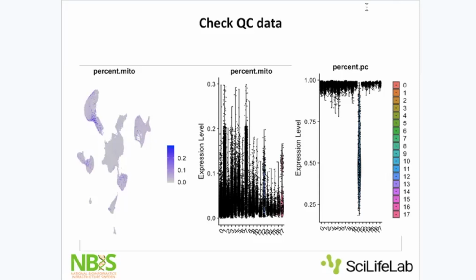Okay, thank you. And one other question, a bit specific to my work, because I've been struggling with this in the past few weeks actually, is that when I cluster a group of cells based on the cell type, so I have identified the cell types, and then when I cluster them, I was expecting to see very marked different clusters, but then I always find some very close or overlapping clusters.